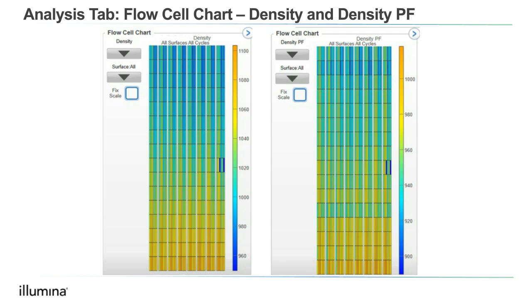Due to the fluidic system, the cluster density is highest at the inlet, which is visualized at the bottom of the flow cell chart for the HiSeq graph here. The cluster density value should not vary significantly between the lanes and tiles. With an overclustered run, you may observe that the cluster density is highest at the outlet, and you may see tile-to-tile variation rather than the nice gradient.